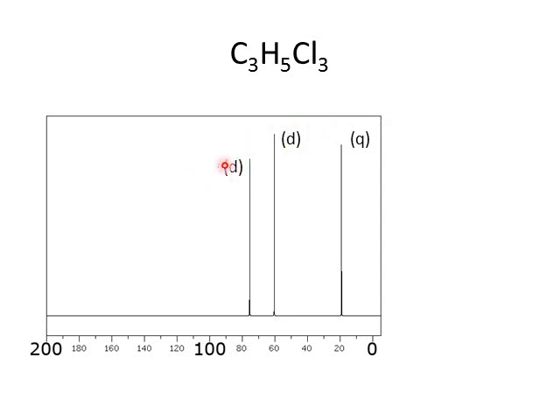So what you'll see for these little abbreviations is S for singlet, D for doublet, T for triplet, Q for quartet, and not so much here, but in hydrogen NMR we might refer to multiplets, things that are basically more complex looking. All right. These are what I have. I'm going to have to figure out what my molecule is based on this information.